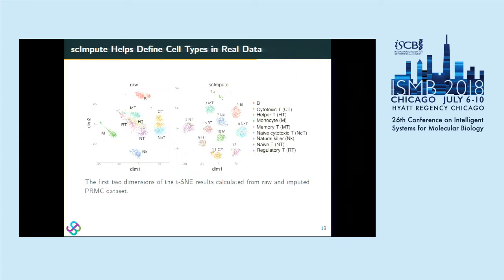In this case, it seems that after the imputation, you tend to get more discrete cellular populations here. Is that a better result? Because sometimes we may appreciate a more continuous cellular distribution. If you dissect the one big group into more discrete subgroups, it might introduce some other issues, I guess.